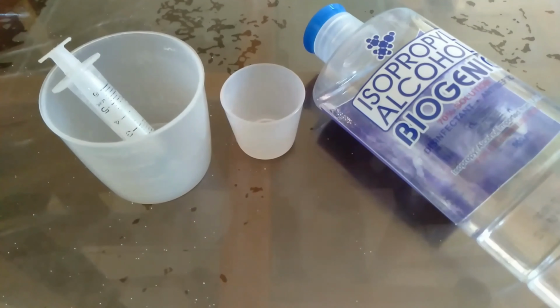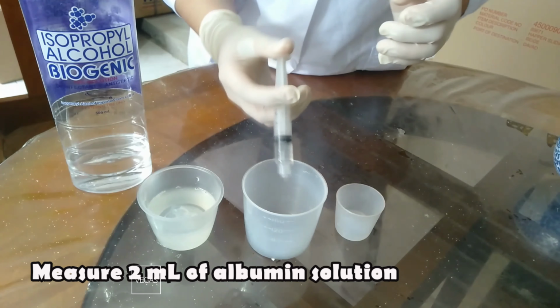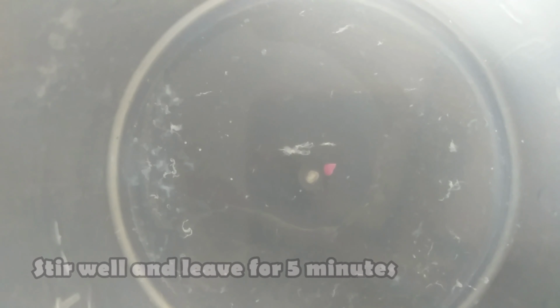The third experiment involves alcohol. We'll be using medicine cups, syringe, 70% alcohol, albumin solution, and fork. Measure 2 ml of albumin solution and put it in a container. Add in 5 ml of alcohol. Stir and leave for 5 minutes.